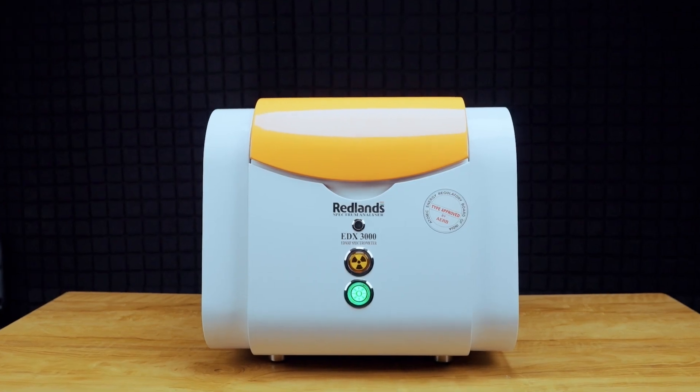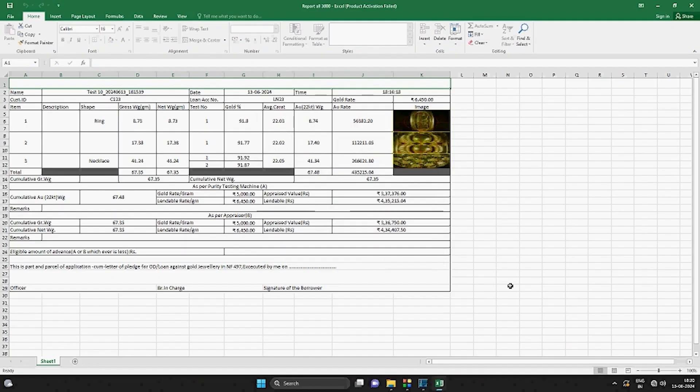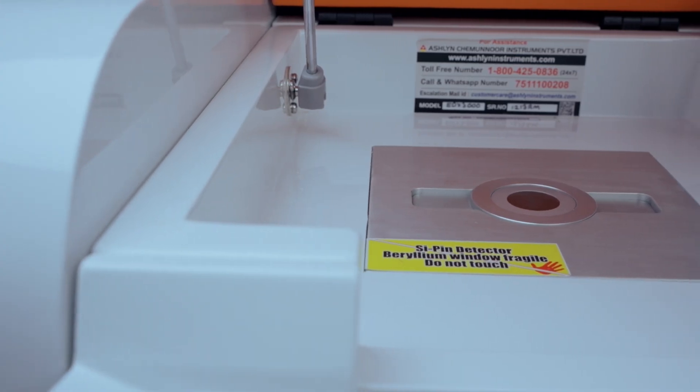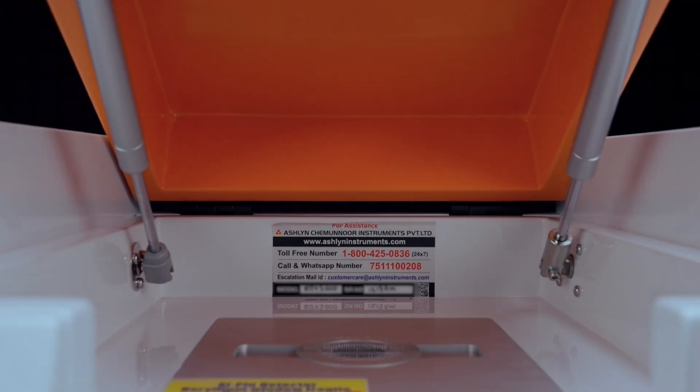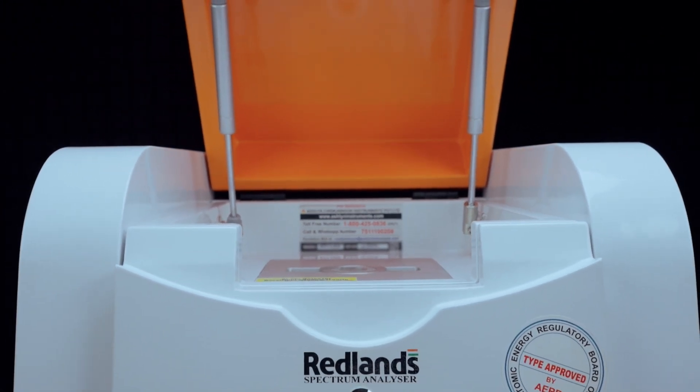All tested results are saved in records and can be easily retrieved by searching customer names or dates. The printout includes all necessary customer data, including images of the tested sample. The comprehensive evaluation report makes Redlands XRF machines highly beneficial for clients, providing easy evaluation mechanisms and maintaining records.